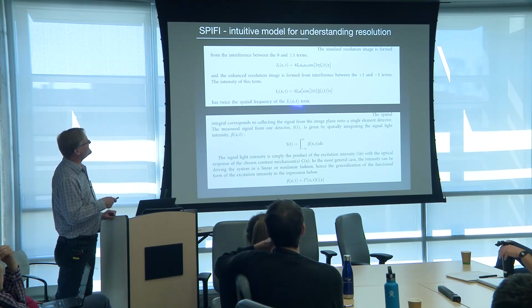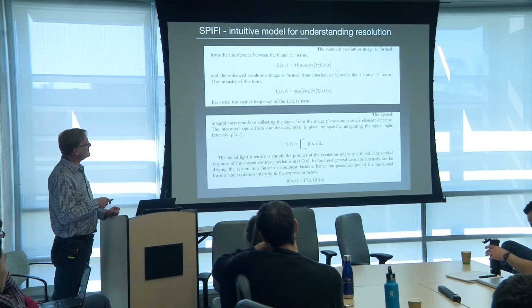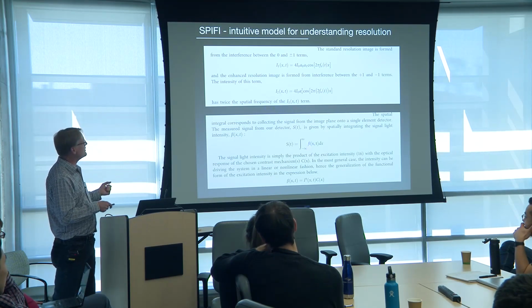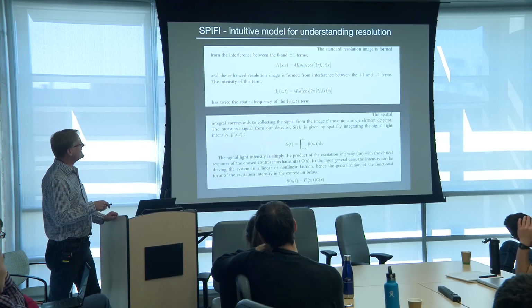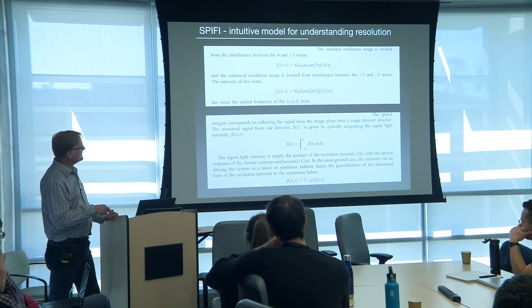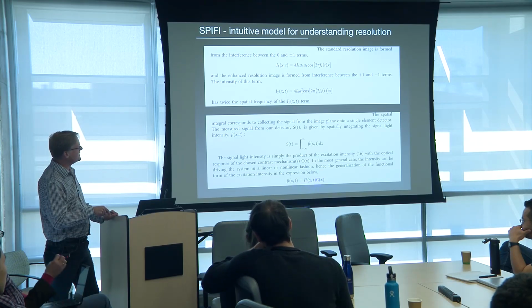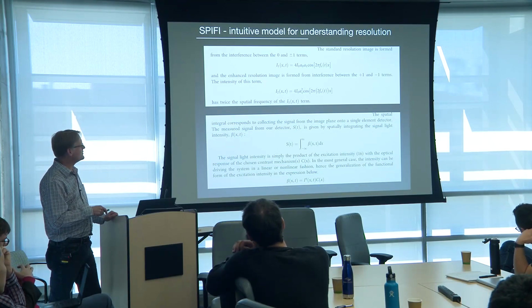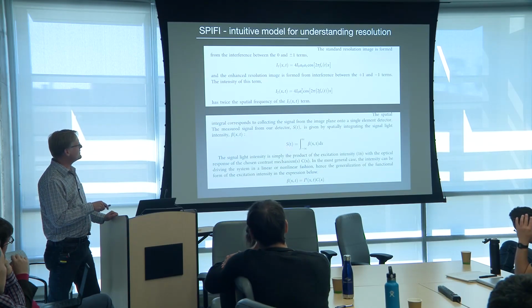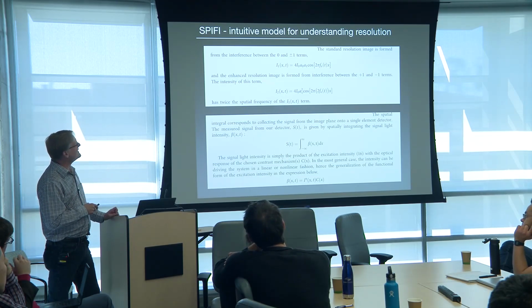Okay, so it's there if I can get to it. So what we do is, your detector spatially integrates over all of this signal, and you've labeled it with a fluorophore or something. And so this is what the measured signal from your detector looks like. Ultimately, you can take that intensity profile to any power. We're hitting some fluorophores, and this is our fluorophore distribution. That's what beta looks like. There's our voltage versus time signal. But now if I take the Fourier transform, I can get my signals out.